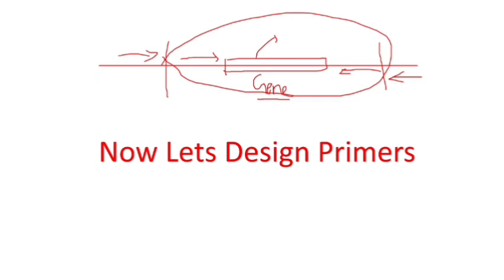So the primer should be outside the gene, in the flanking region, so that we can get the full gene amplified. For that we need to get some sequence upstream and some sequence downstream of the gene which we are going to target.